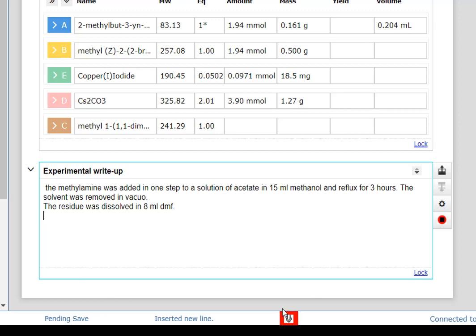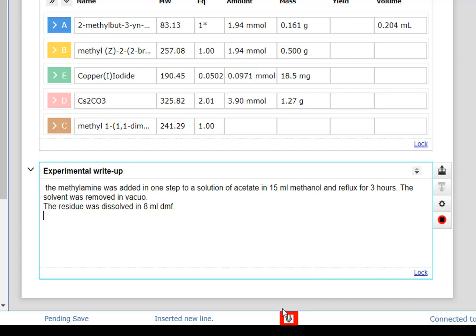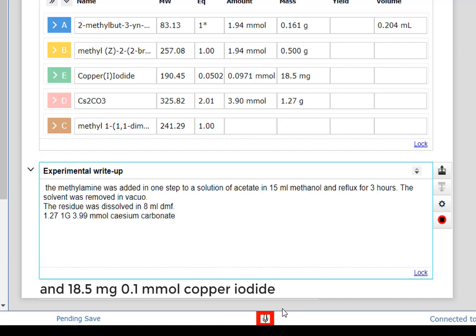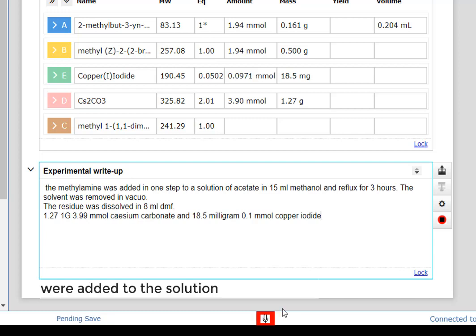1.271 g (3.9 mmol) cesium carbonate and 18.5 mg (0.1 mmol) copper iodide were added to the solution.